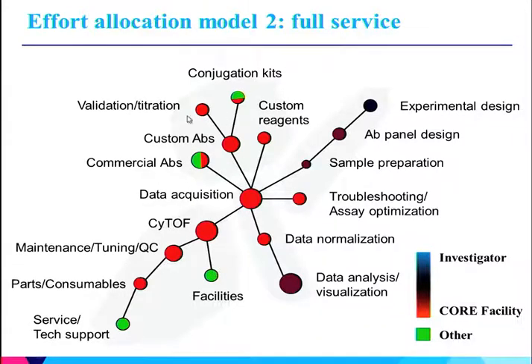And the primary motivation for doing this is actually just cost savings, because an average antibody from DVS costs about $350 a pop for a vial that you can do 100 experiments with. But when someone wants to do a pilot experiment, they don't necessarily want to do 100 tests. And so let's say you just want to run 2 samples, but you want to look at 30 different parameters. You're looking at $10,000 worth of antibody you have to buy to do that pilot experiment. So that's obviously a very significant barrier to someone being able to start an experiment.